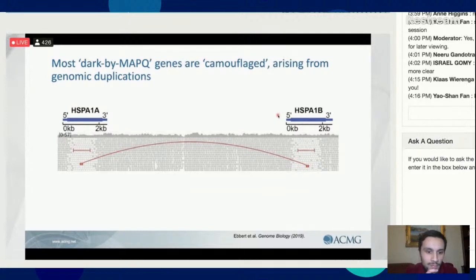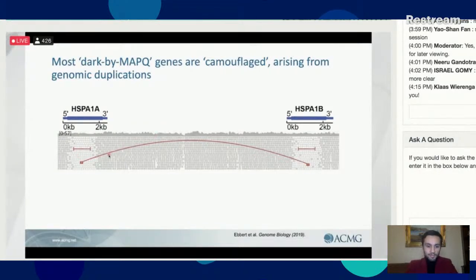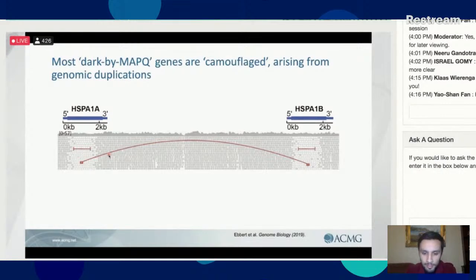And that means that there's also a large portion of them that are identical. It's approximately 50% of the genes that are identical. So when the aligner gets one of these short reads that aligns equally well to either gene, it doesn't know where to put it. So it randomly assigns the read to one of the locations and gives it a mapping quality of 0. But as I mentioned, the end result is that all variants in this region or this region for both genes are completely ignored.